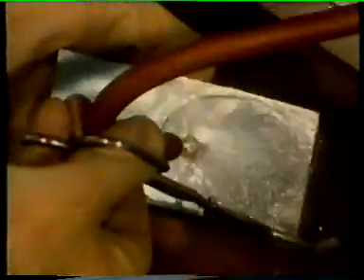And there we are. Next, we treat the carefully prepared surface with a very powerful acid. Gloves are essential for this operation. As soon as the acid's had time to react, the metal must be washed. It's then given a second treatment with another special chemical. We call this process etching. The particular chemicals used depend on the metal we're trying to etch.